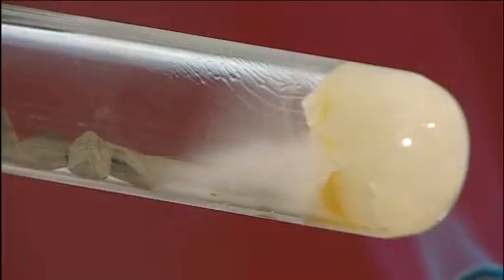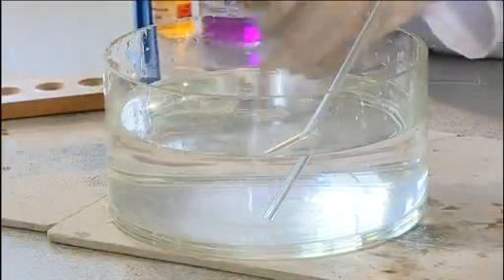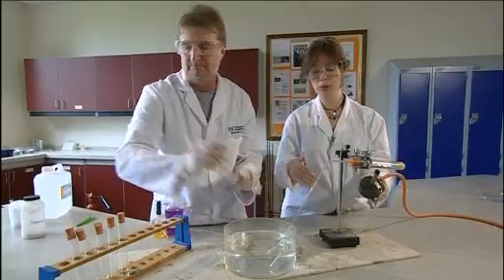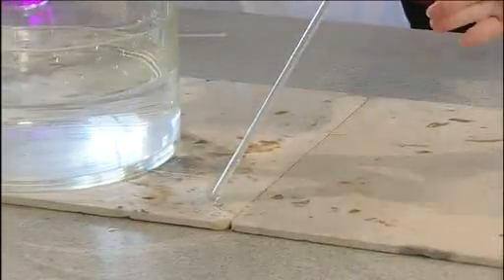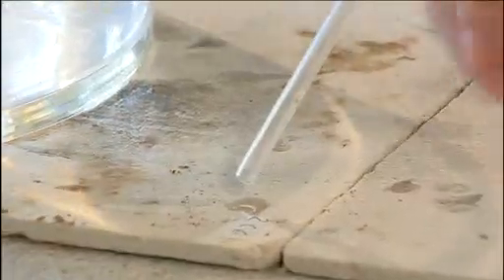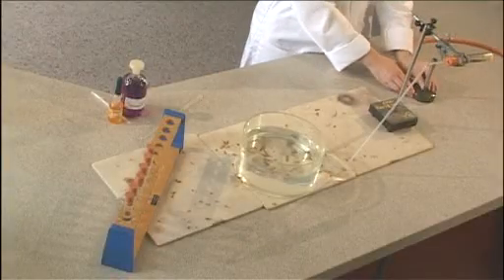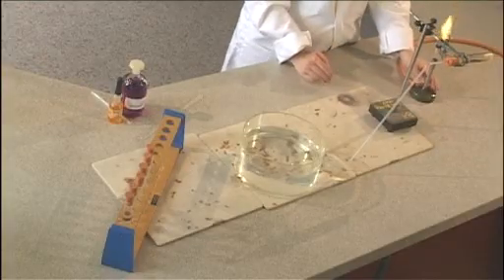Continue until six test tubes of gas have been collected. When you come to the end and you need to remove it from the water and stop heating it's really important that you remove from the water first and carry on heating for a moment. When you're happy that there's no water in the tube you can stop heating but I wouldn't turn off the Bunsen burner until you're convinced that everything has stopped.